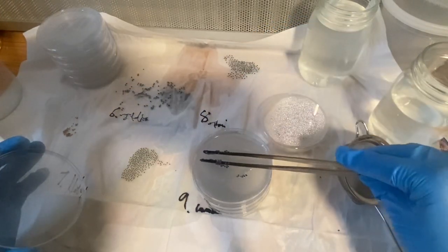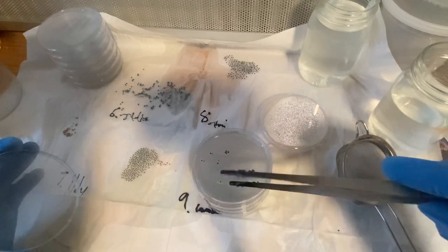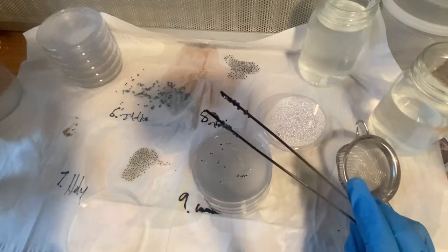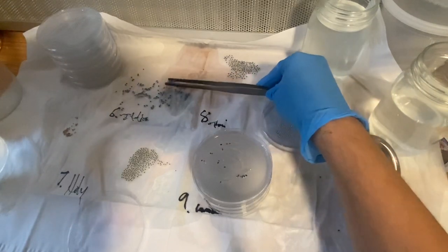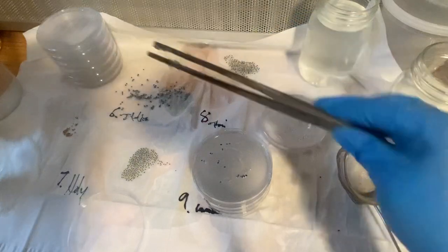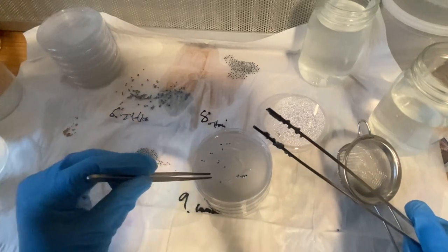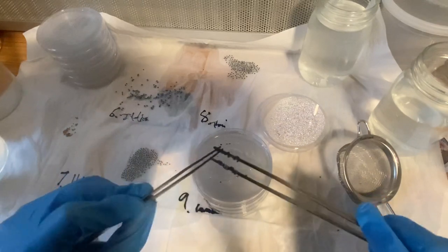Could use a needle point forceps for this. You could actually use needles, sterile gauge needles. I'm going to go ahead and grab another tool to help facilitate these seeds coming off so that they can go onto the media. Pulling my tools down.